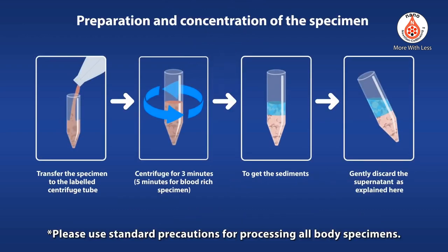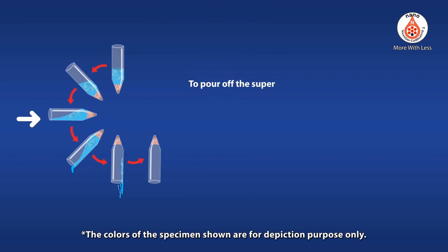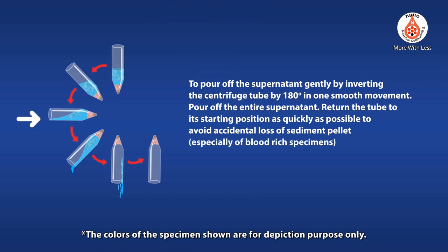Please use standard precautions for processing all body specimens. To pour off the supernatant, gently invert the centrifuge tube 180 degrees in one smooth movement and pour off the entire supernatant. Return the tube to its starting position as quickly as possible to avoid accidental loss of the sediment pellet, especially with blood-rich specimens.